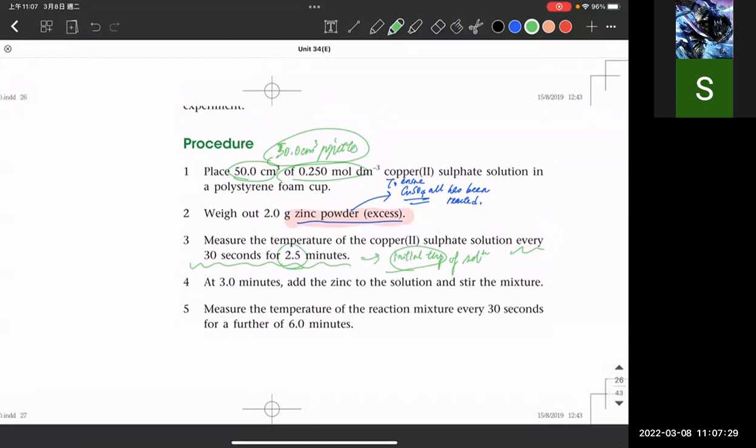Just like while you are having fever, for example, these days, when you put the clinical thermometer directly into your mouth, can you just directly take it out and measure the temperature, the room temperature? The answer is no. Usually, we put it in the mouth and stay for some time. This is still the same thing. It's a very traditional way of measuring the temperature using that type of fluid thermometer. But of course, nowadays you use something like an IR thermometer, such like this, right?